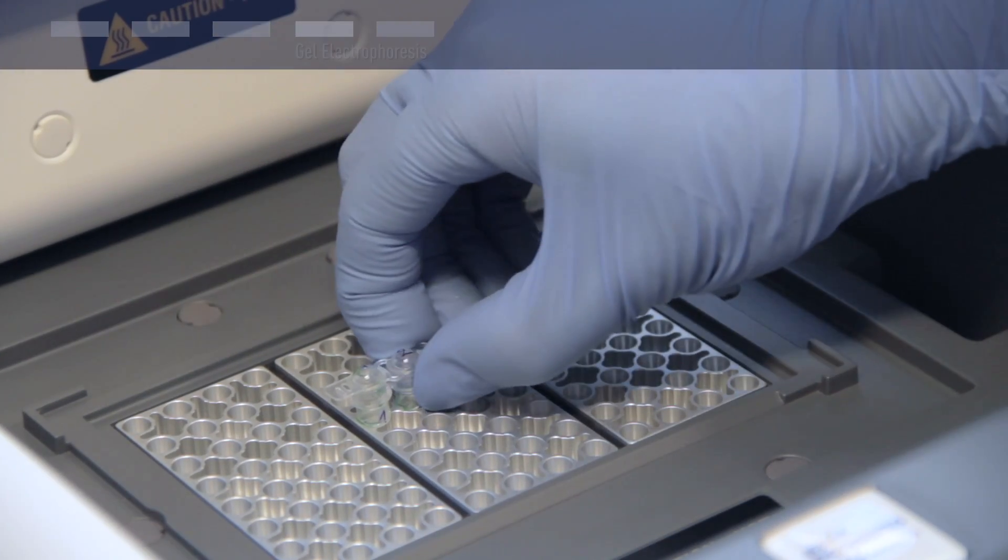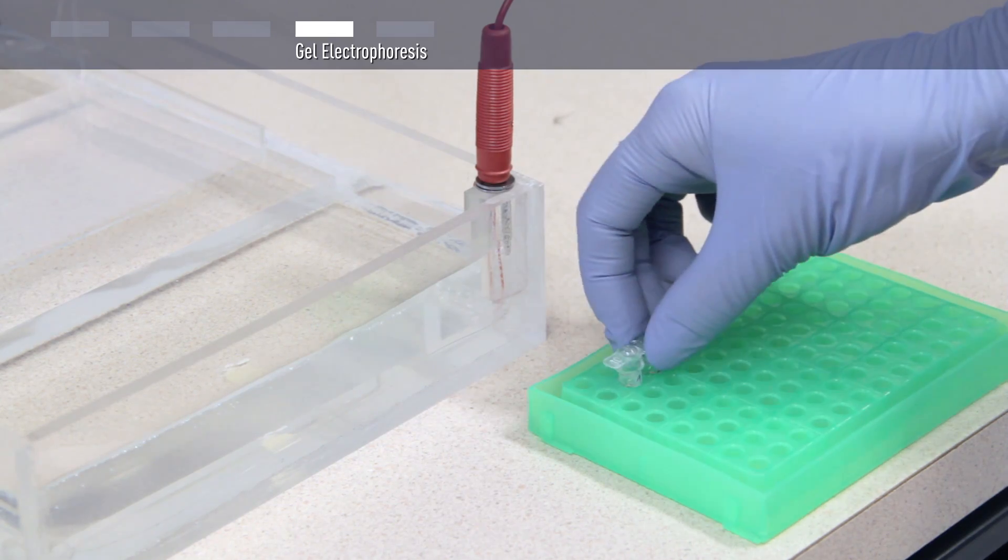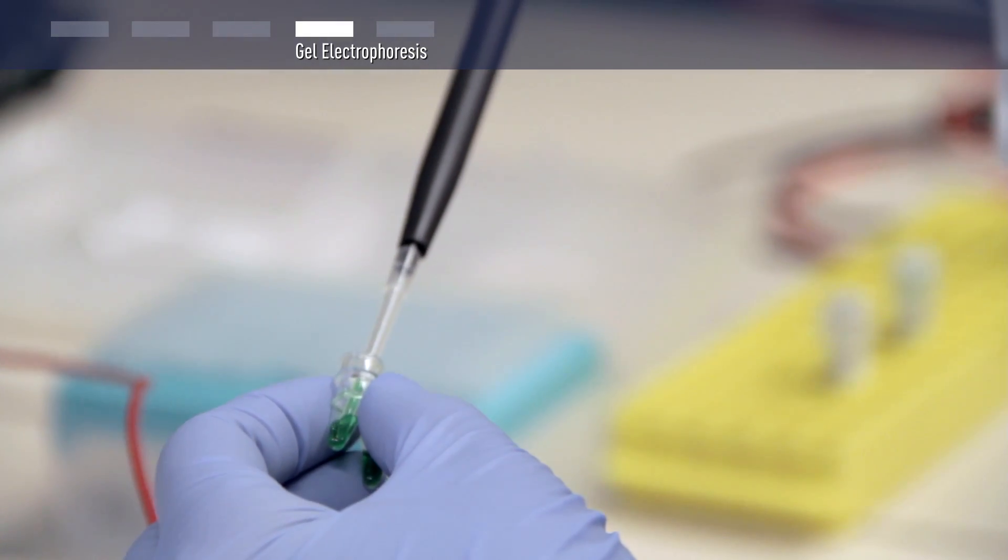After PCR, analyze products by gel electrophoresis. To do that, simply load 5 to 15 microliters of your PCR mixture directly on a gel.